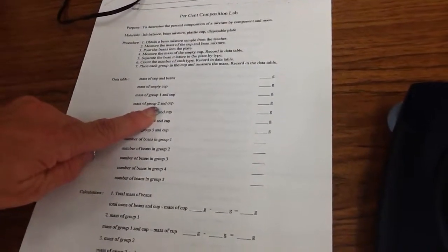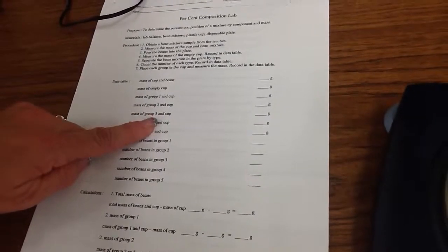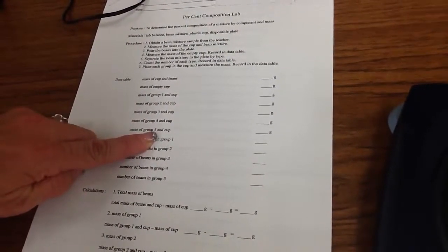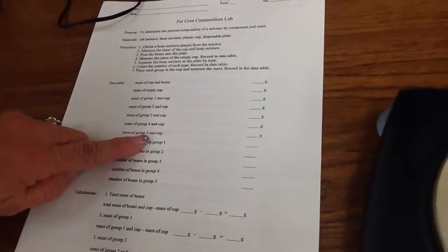Mass of group two, it doesn't matter. Give it a name. Yellow beans, pinto beans, black beans, and white beans. Just give them a name and weigh all of them together.